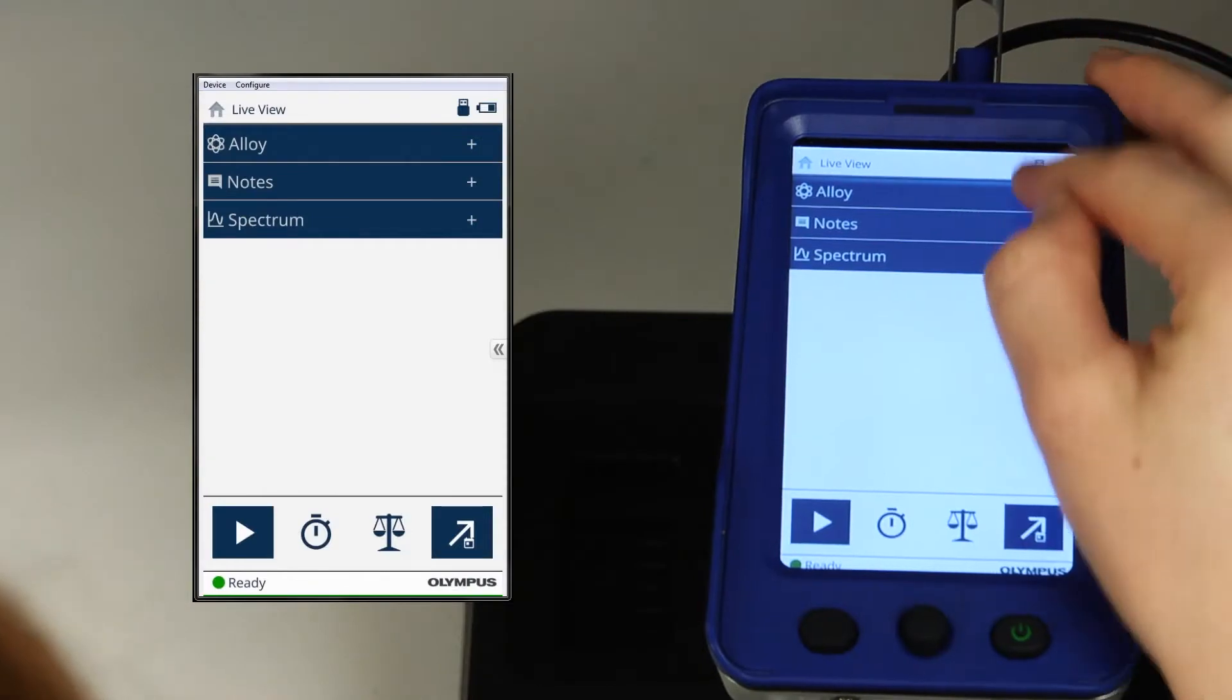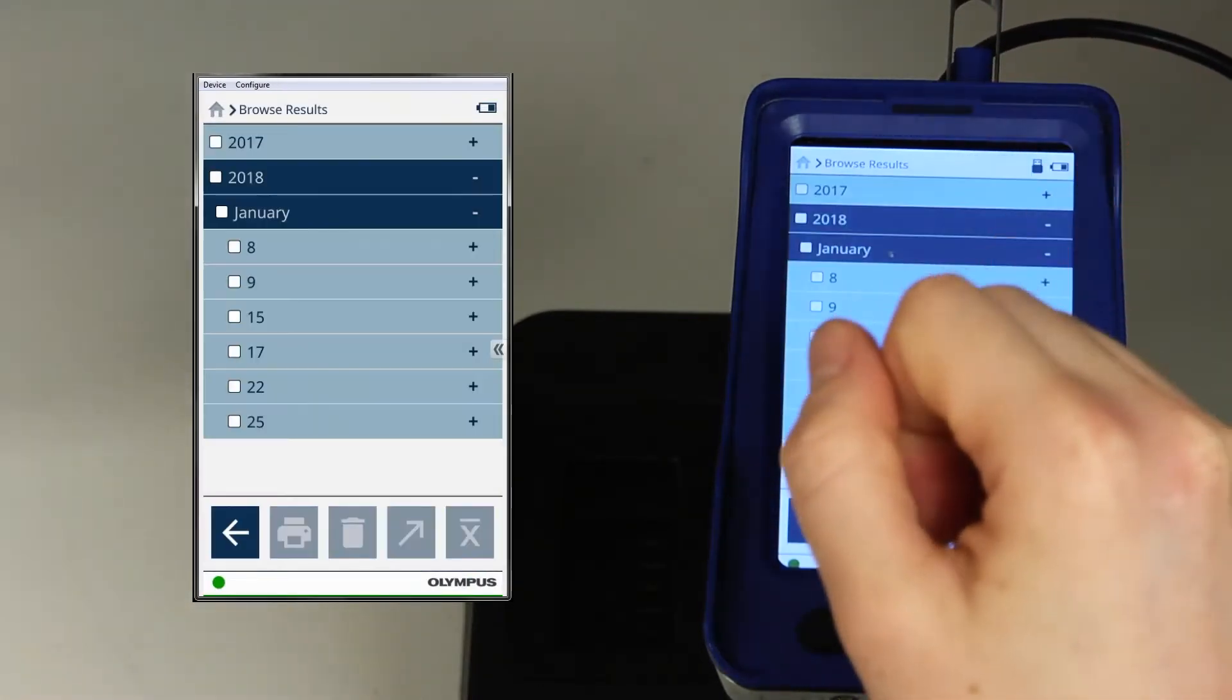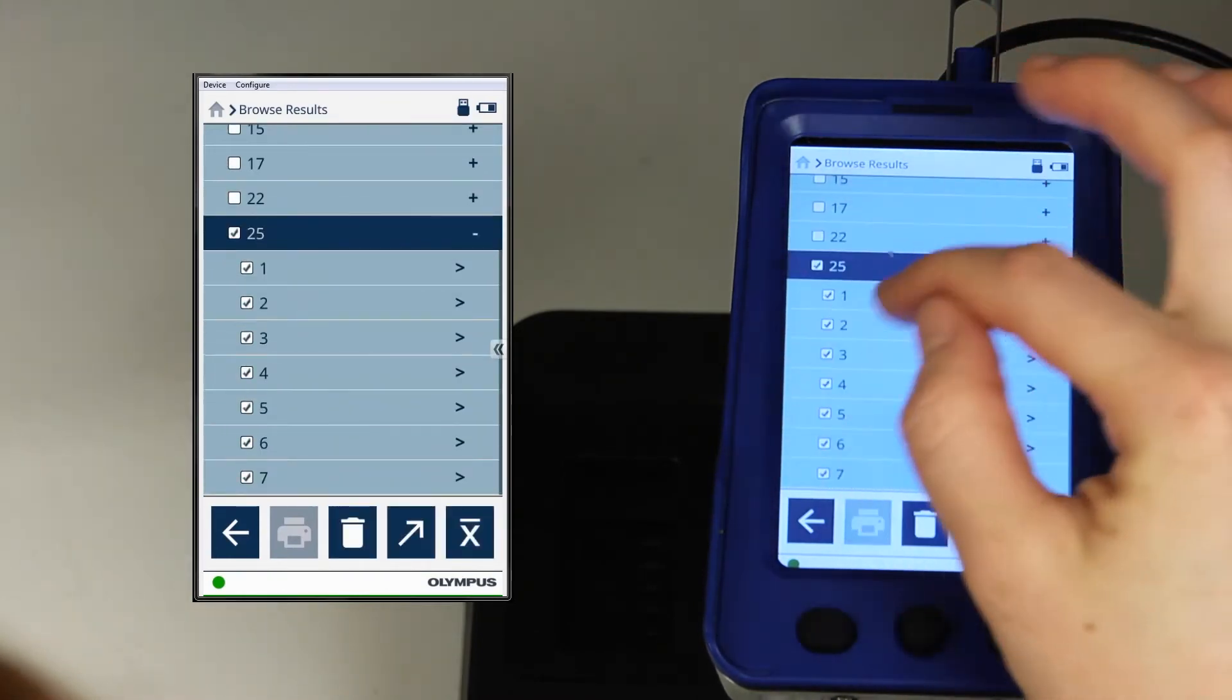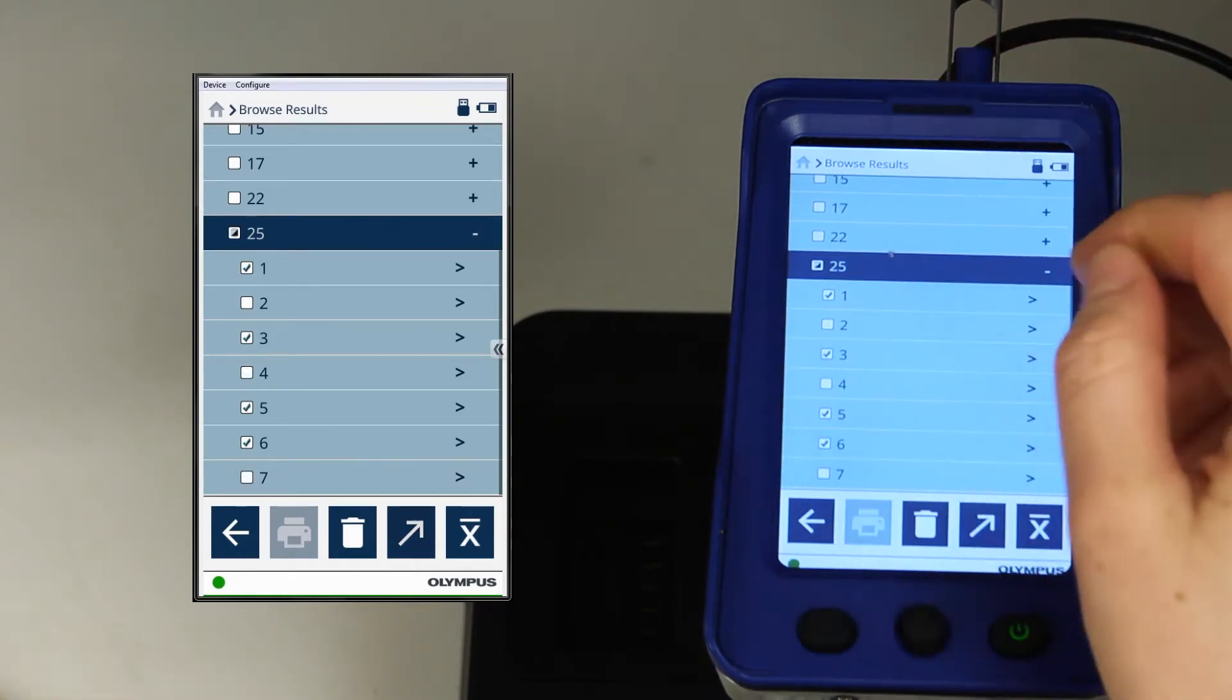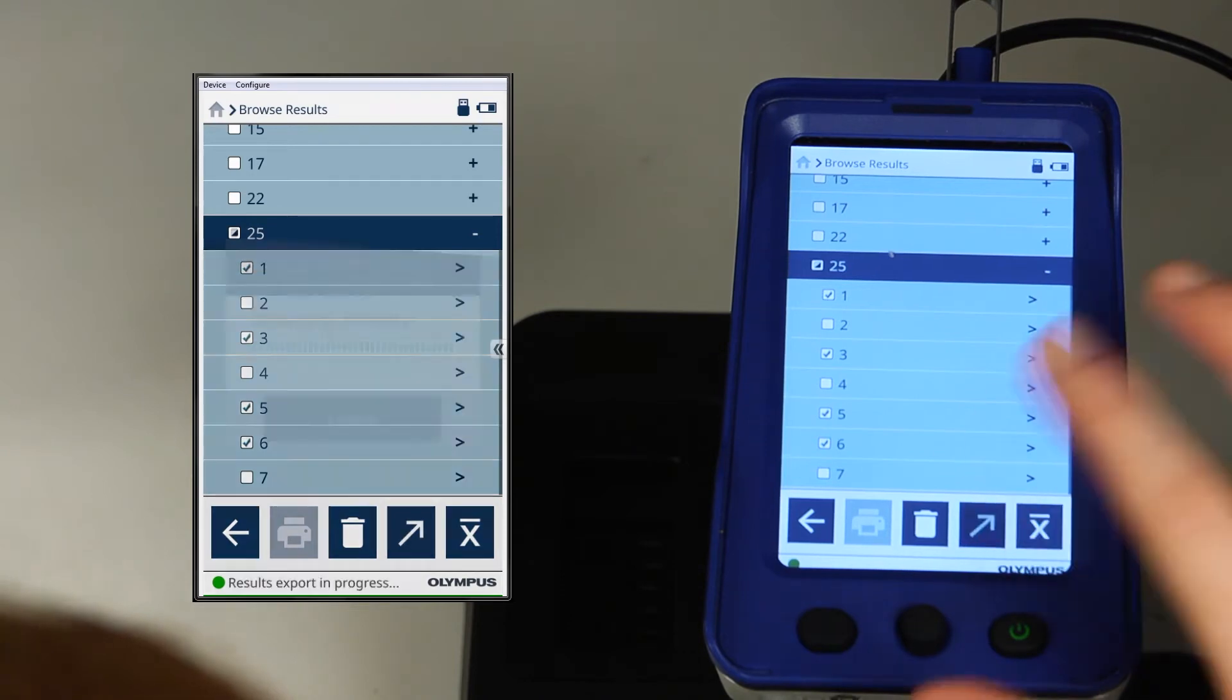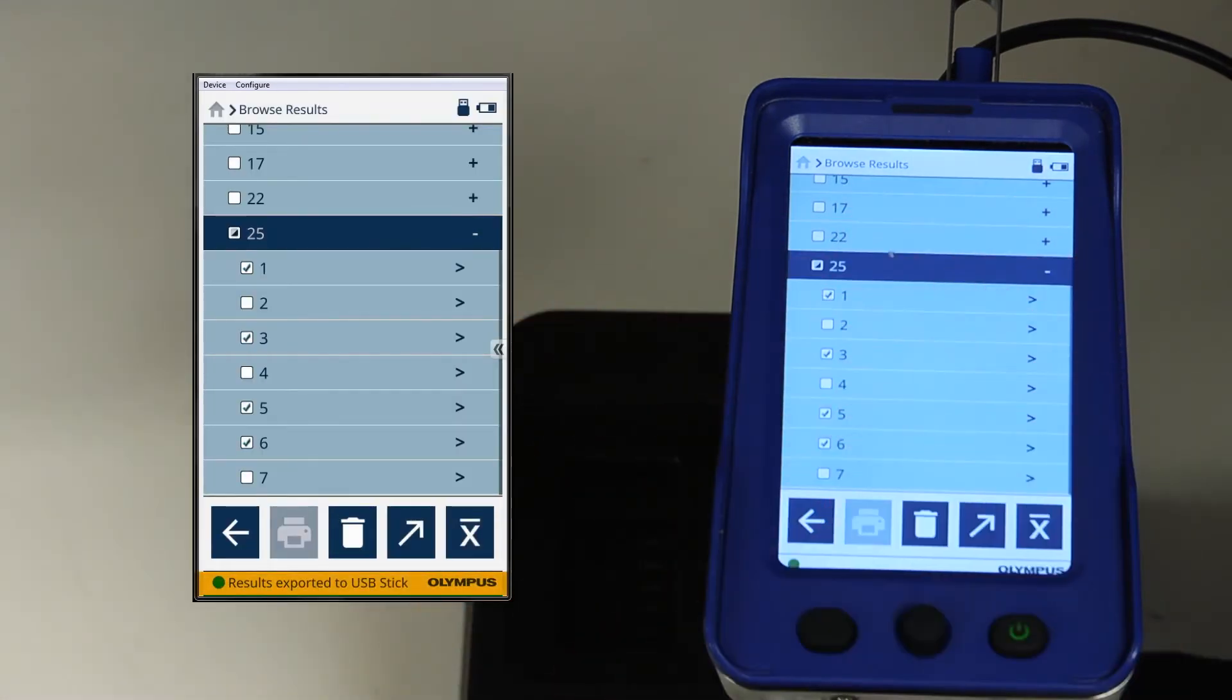The other option, browse results, allows me to select individual dates and individual results. Once I've selected all the tests that I want to export, I press the arrow key and once completed, I'll see results exported to USB stick.